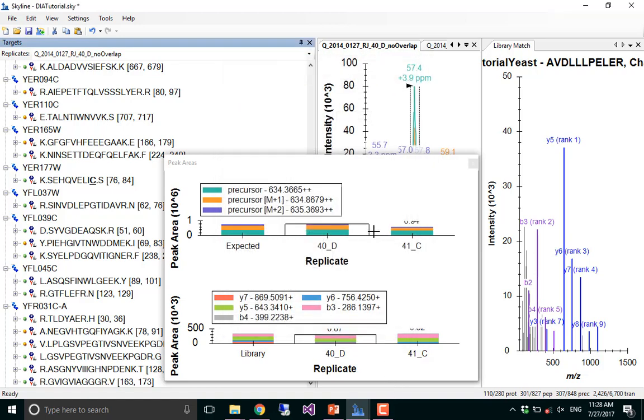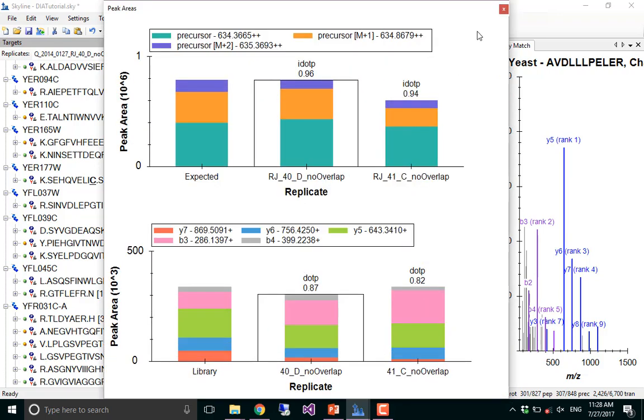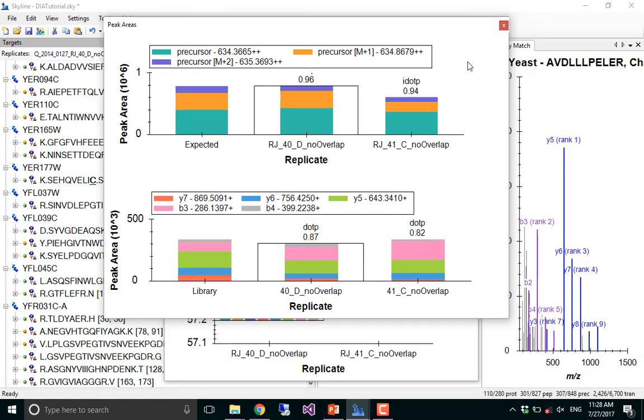I mean, I guess you could have seen if there were some heavy labeled peptides in the data set, but probably not. Hopefully not. As someone who's used Skyline for maybe 8 years, this whole high contrast mode is really throwing me for a loop.